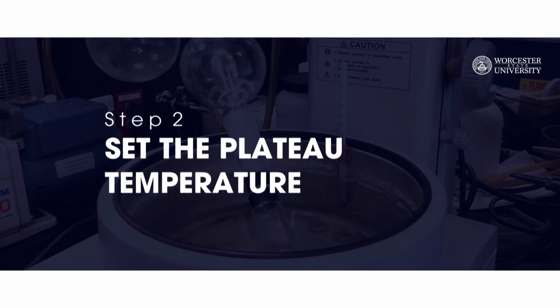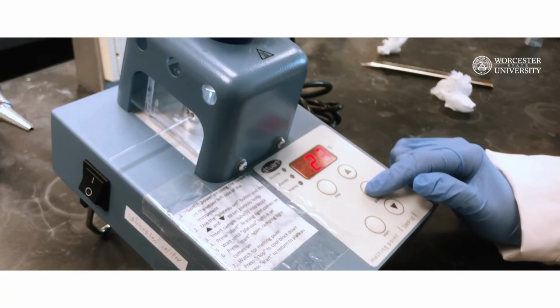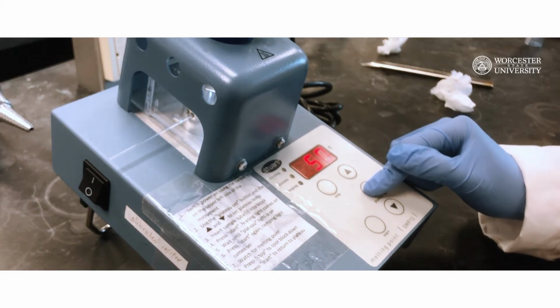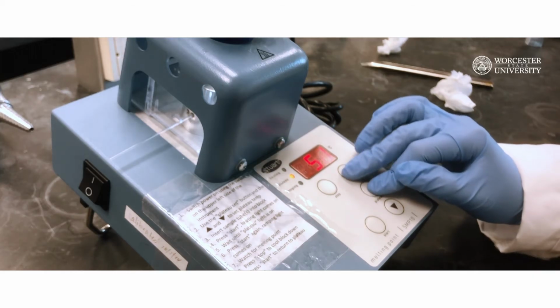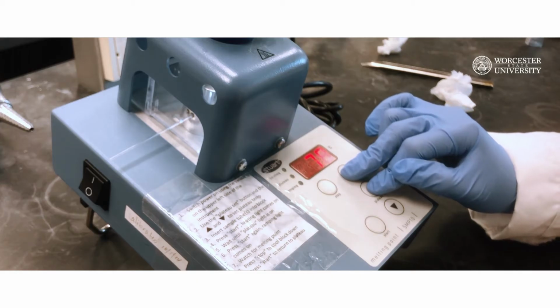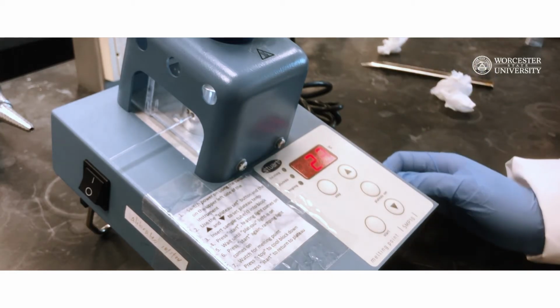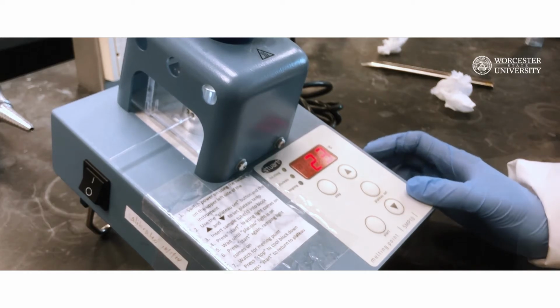Step 2. Set the plateau temperature. As said above, the plateau temperature should be 5 to 10 degrees Celsius below the expected temperature. To set the plateau, press and hold the plateau set button. The plateau light will flash, and the display will now show the current plateau temperature. If you need to change the displayed plateau temperature, while continuing holding down the plateau set button, press the arrow keys up or down to adjust. Then release the plateau set button. The new plateau temperature is now set and all function lights will go out.